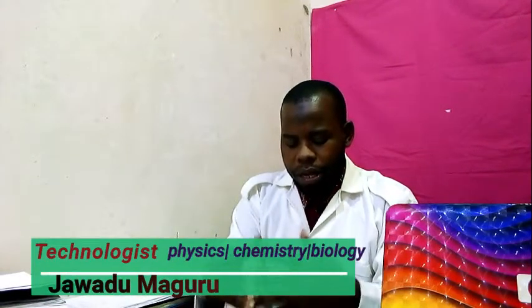When you perform titration with potassium permanganate, the end point you are going to see is pink. Potassium permanganate will be in the burette and the sodium oxalate will be in the conical flask. And when we perform procedure 2, potassium permanganate will be in the burette and the ammonium ferrous sulfate will be in the conical flask. So the end color change you see is the observation of pink color.